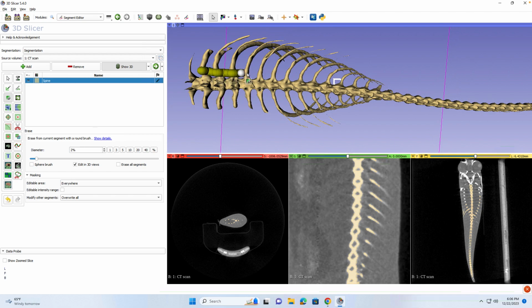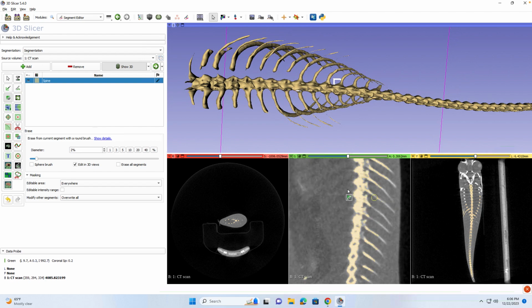So the thing is, with the images on the bottom, why I kind of brought those back up is because you can do it in here and it'll cut it like that. But with this, you would have to go through multiple slices, right, to get the full thing cut. So it's maybe a little easier to just do it in 3D, but if you want to be very precise with it, I would definitely go down there and do that. This isn't too bad, especially when you want to clean it up big time. Here I'm just going to be showing you kind of quickly how you can get through this.